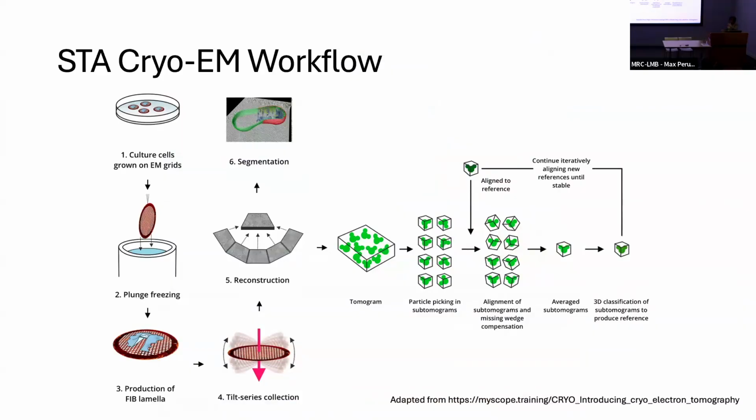You see the cell, but there are some proteins around, like ribosomes, as in cryo-EM. They are very tiny dots. If you want to look at the particle or improve the resolution of this image, you can use the single particle method to average them together. If you identify the particles and find out their orientation, you can average them and improve the signal-to-noise ratio a lot. The technique is quite complicated.